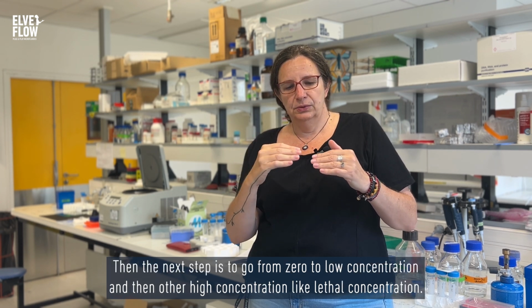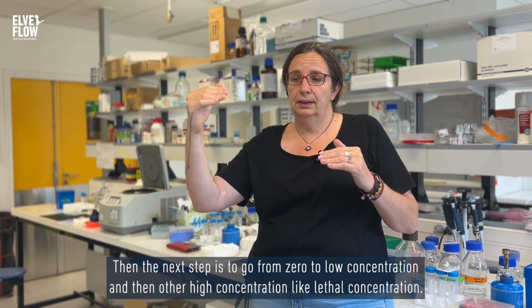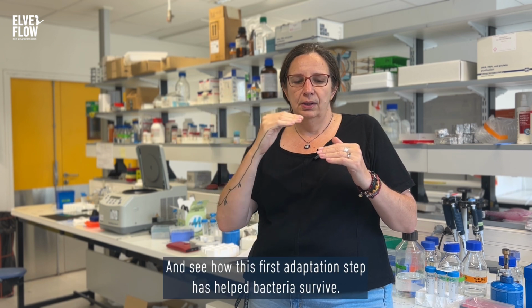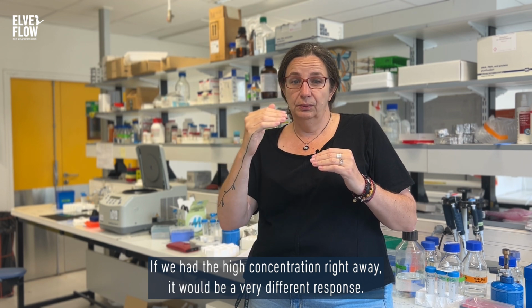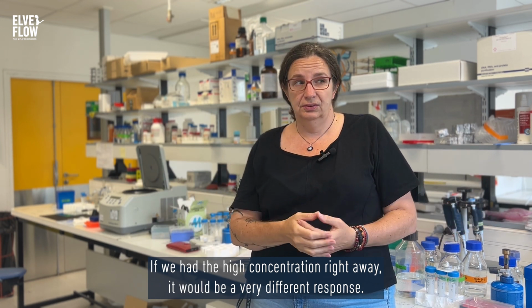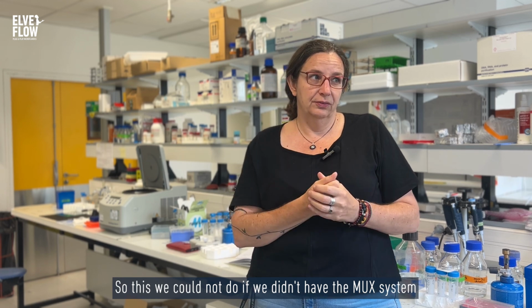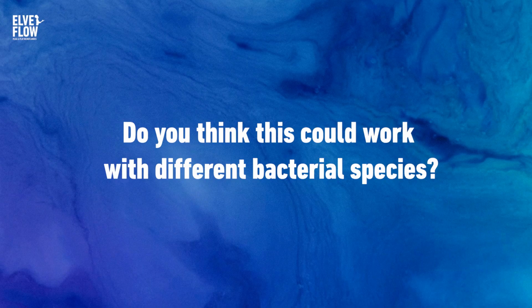Then the next step is to go from 0 to low concentration, and then add a high concentration, like a lethal concentration, and see how this first adaptation step has helped bacteria survive. If we add the high concentration right away, there would be a very different response. So this we could not do if we didn't have the MUX system and the fact that we could program.